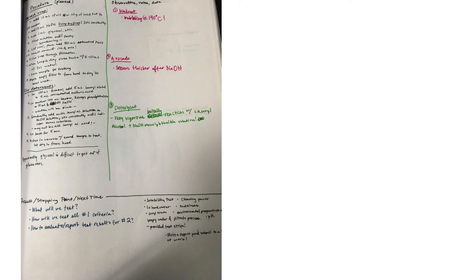This one is from a student who liked to do the double column setup. Plan and procedure on the left side, they have the observations on the right side. One thing I really like about this particular page is that this was a 2-week lab, and the student stopped at the end of this first week and said, "Stopping point, next time," and wrote notes about the things I need to think about for the second part of this experiment. What will we test? How will we test all the number one criteria? How to evaluate slash report test results for number two? And then there's a few notes on, these are the things that we thought we will test. So I really like having that, here are the things that I thought of while I was in the lab of how I want to analyze my data, how I want to test results in the future.